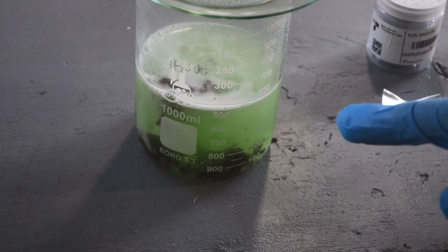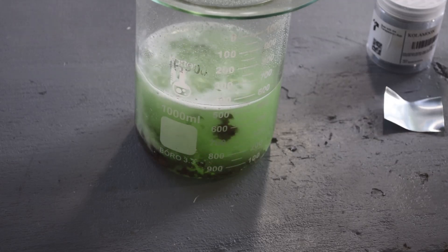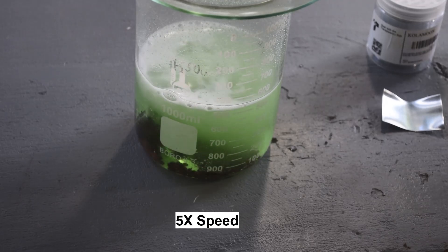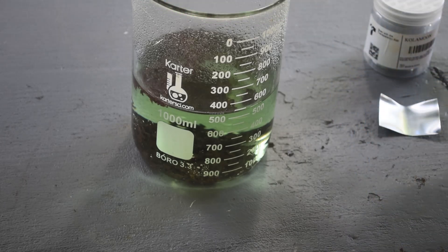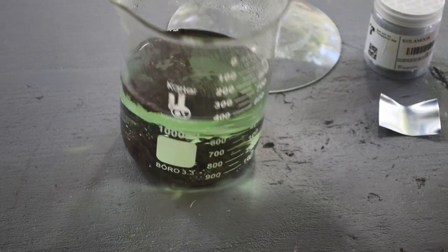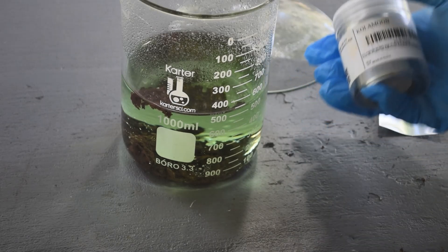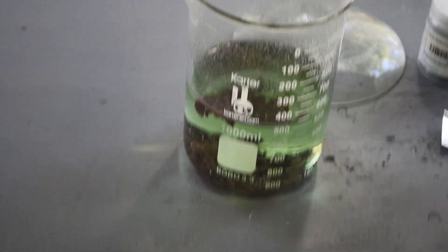Do you see that black stuff floating around in there? That should be the metals we're cementing out of solution with the zinc. I do believe the color is fading — oh, we're getting a lot of black stuff floating around in there! And that's still just the first two pieces of zinc, I haven't put any more in. So okay, something's definitely going on in there.